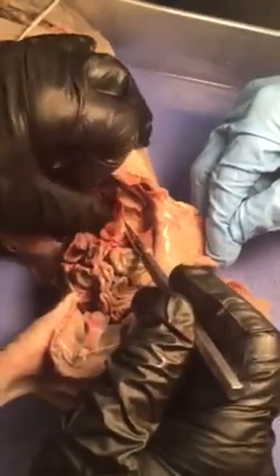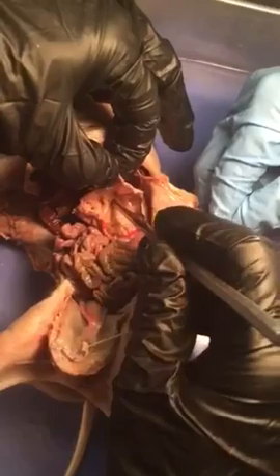Okay, so I can get it up into the esophagus. If we could remove the liver, which maybe we will, then we'd be able to see the top end of the esophagus where my probe is going through. Let's see if I can get it in there a little bit more. Yeah, it's getting gross.